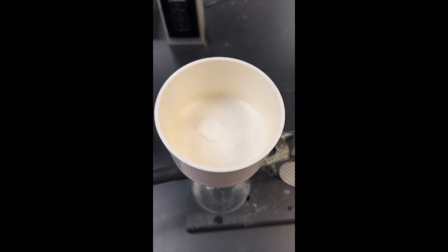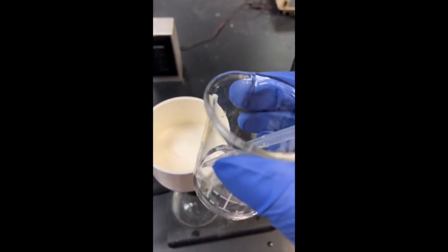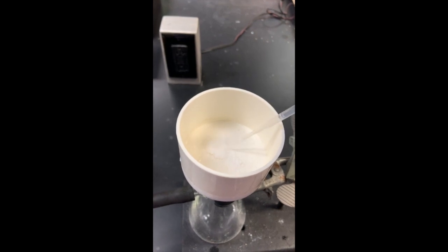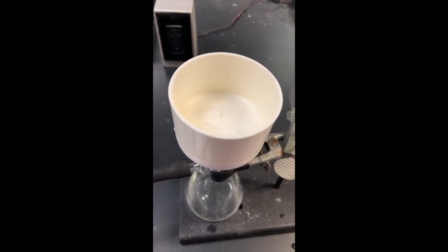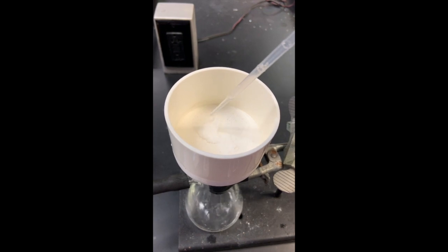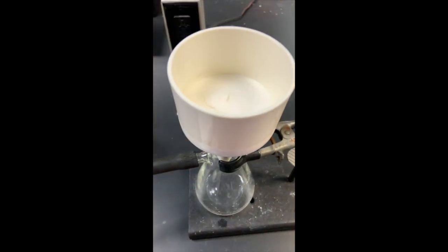So to my funnel, I'm going to add this ice cold water. I'm going to add 2 milliliters total. You see the ice cold water going through the funnel.